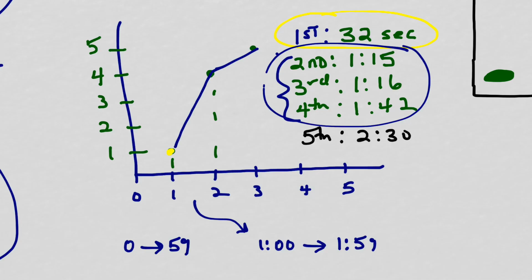And the reason why we try to do this in this lab is because there's going to be some disks that we probably plasmolyze by pulling negative pressure on, and crush some of the cell walls and cell membranes by taking the air out, or some that are dead. So we're going to eliminate all those types of errors by taking the middle value. So to do so, we find the 5th disk, wherever it may be. We hit the value, we hit that line, we do a straight line all the way down. Okay, and we estimate what that time is.